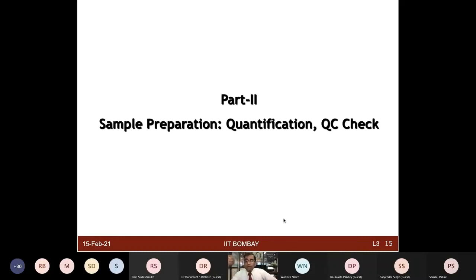Now you have identified that these extraction methods work very well for your sample. You want to know how much protein you got from each of the method types, what the protein quantification yield from those methods is, and how the quality of these samples looks visually and also quantification wise.